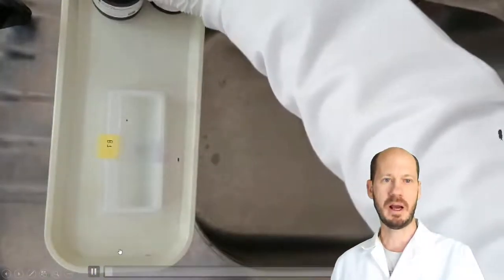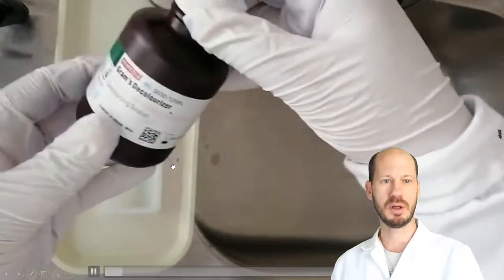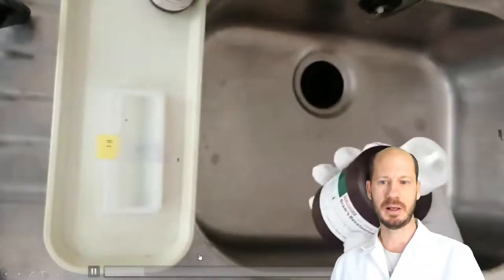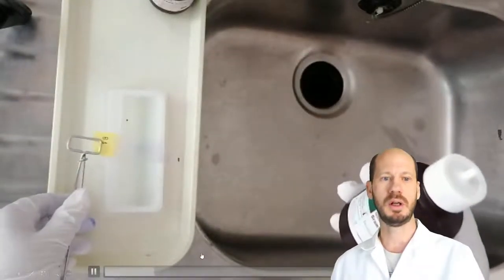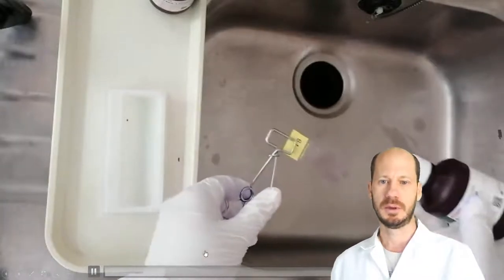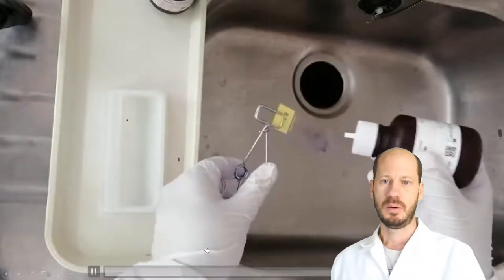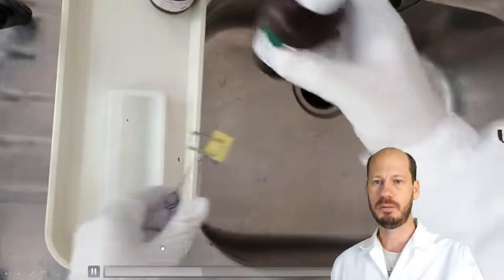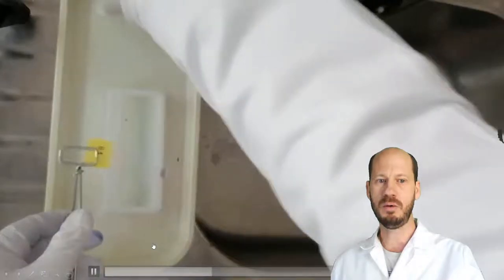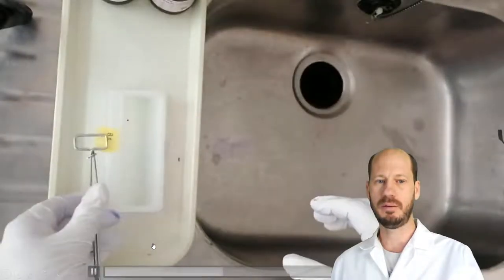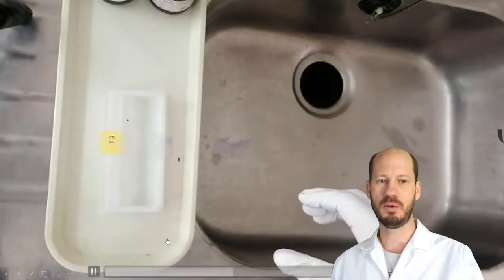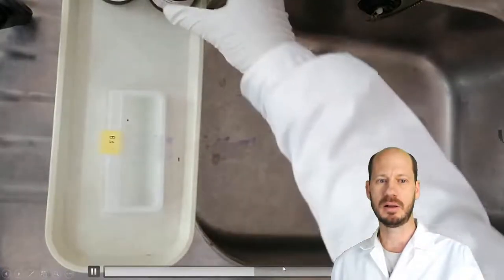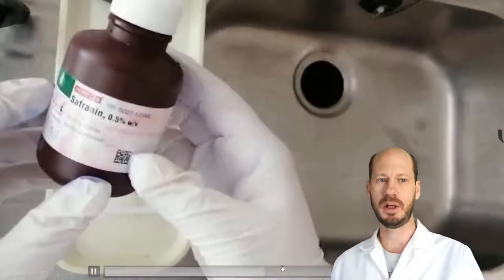Next step now is that we're going to use the decolorizer. The decolorizer is just an ethanol solution usually. As you do this, if the bacteria is gram negative, all the gram stain, the crystal violet will be removed in this step. And the cell will become transparent.